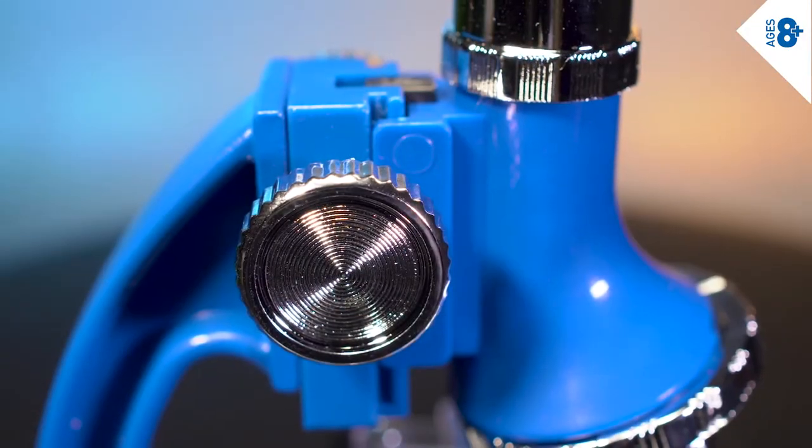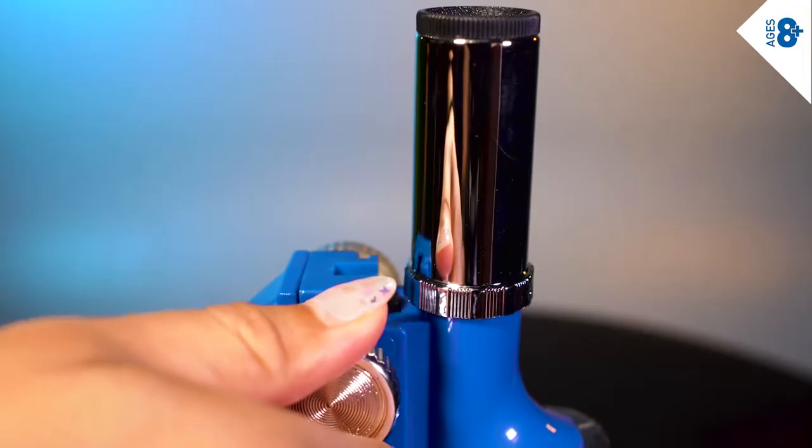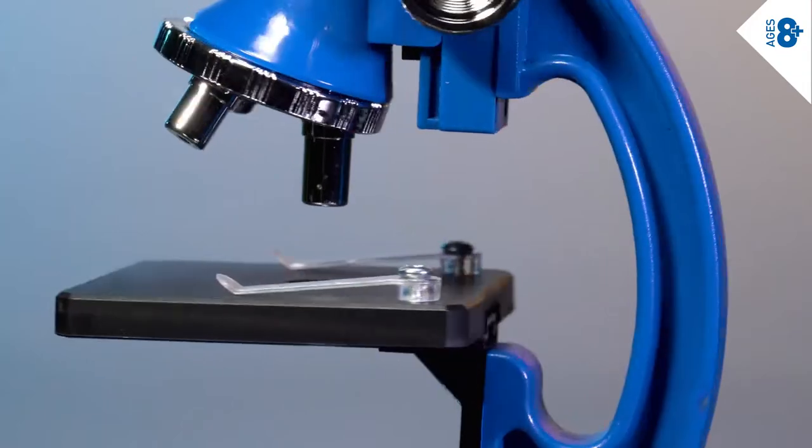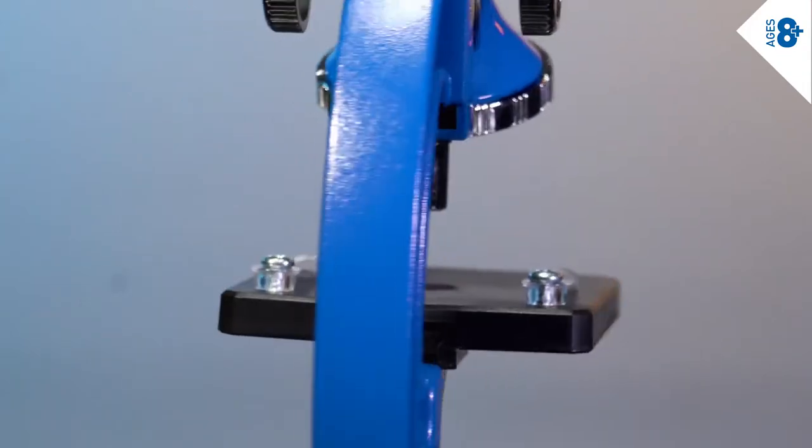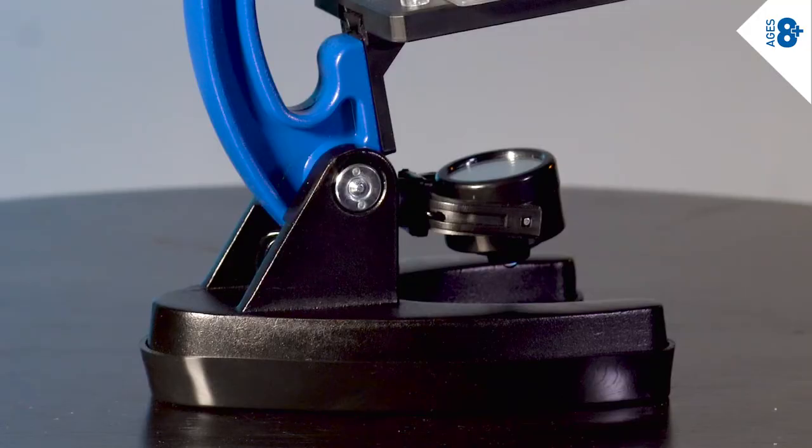The rack and pinion focus allows for careful adjustment to view the specimen at its sharpest. The microscope's arm and base are created using rugged cast metal for many years of use.